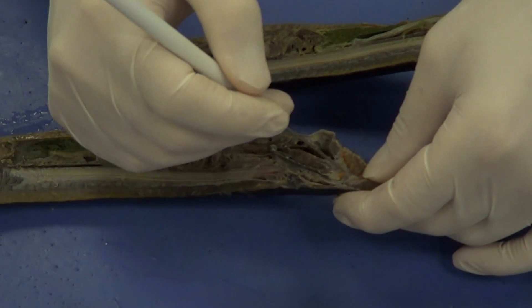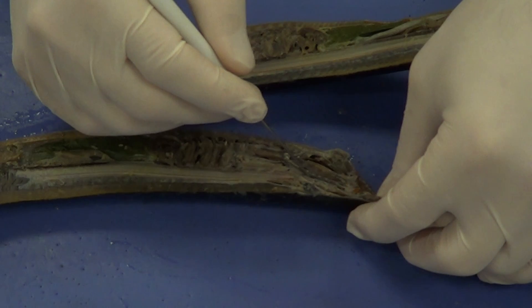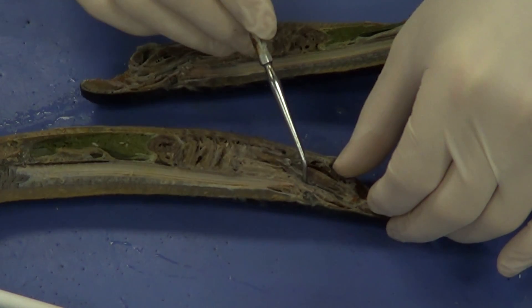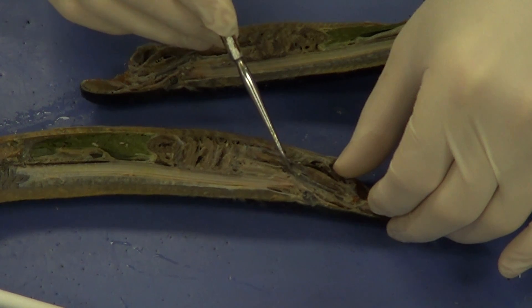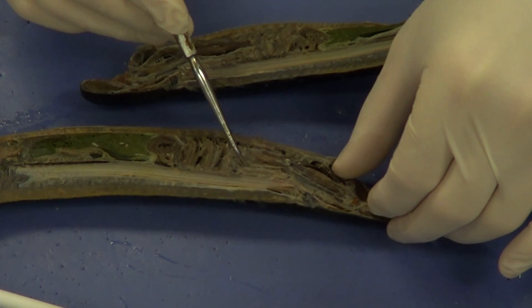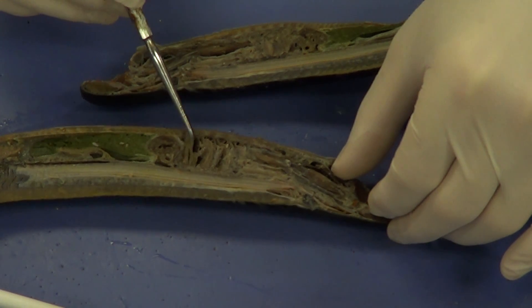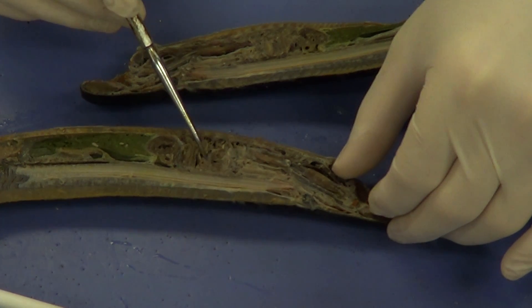If we follow the digestive tract right here, this is going to be our pharynx. The pharynx is actually going to divide into a dorsal branch, which comes up here, and a ventral branch — because it's more bellyward — and that ventral branch is going to become our respiratory tube. That respiratory tube goes into this whole area right here, and we can see the gills — they're very fluffy. You can see a lot of gill filaments there, with lots of surface area.